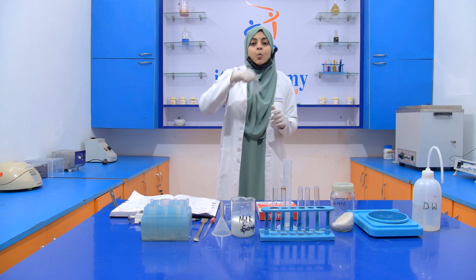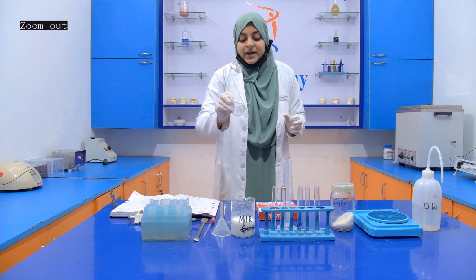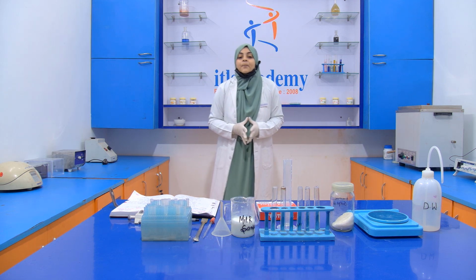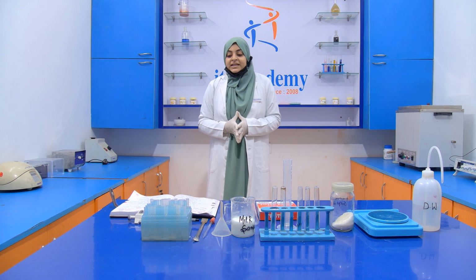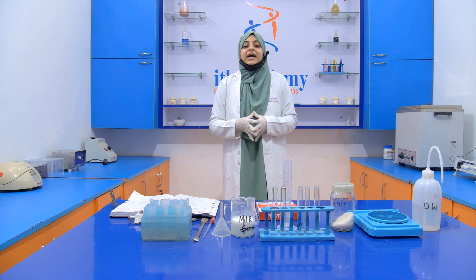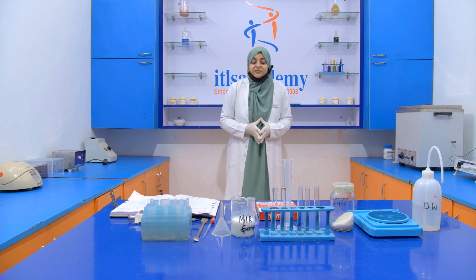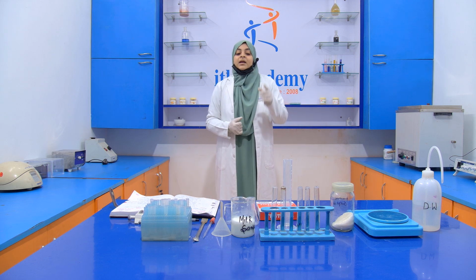We mix it for at least 1 minute. Then we keep this mixture in a standby position for 5 minutes. After that, we filter it with the help of the filter paper. Then after filtration, we take 5 ml of filtrate in a test tube.